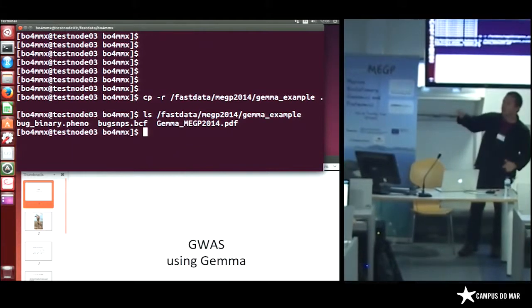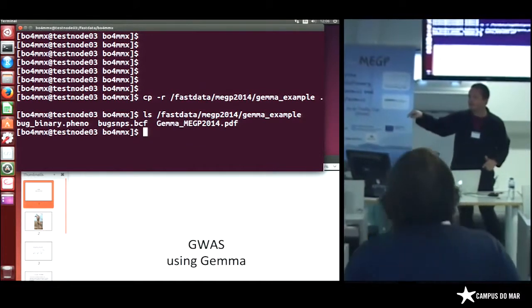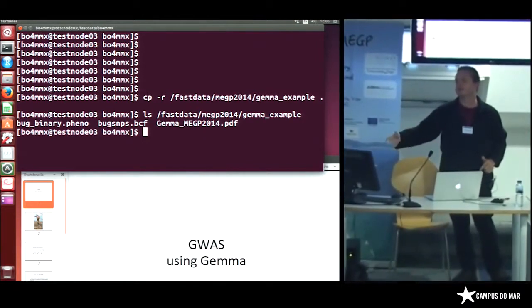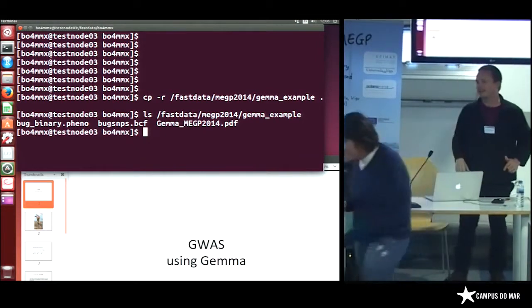And if you go back to the Google Drive directory where all the other things are, the PDF is actually in that folder now as well, so it's much easier for you rather than having to try and get it out of the terminal.